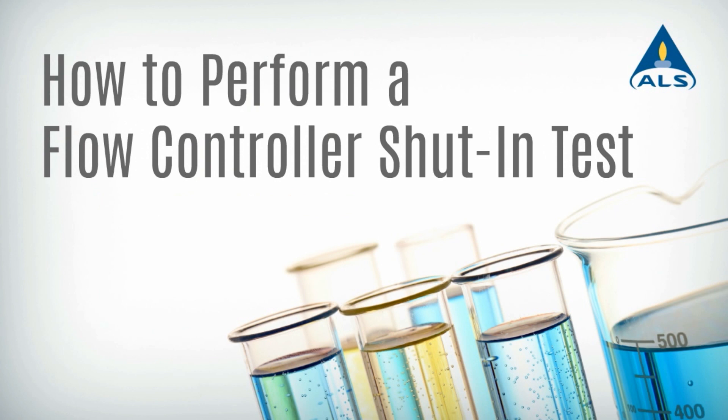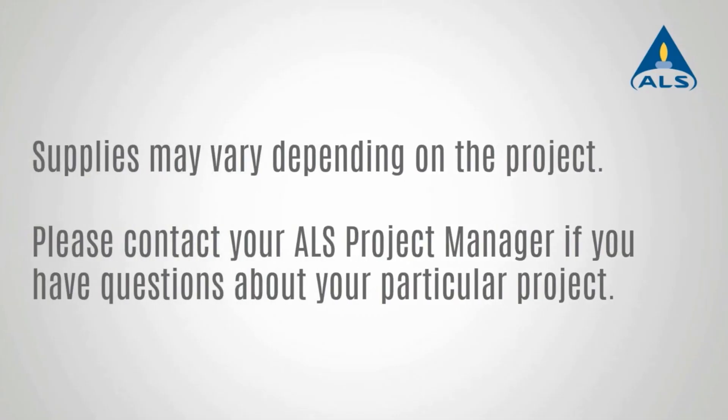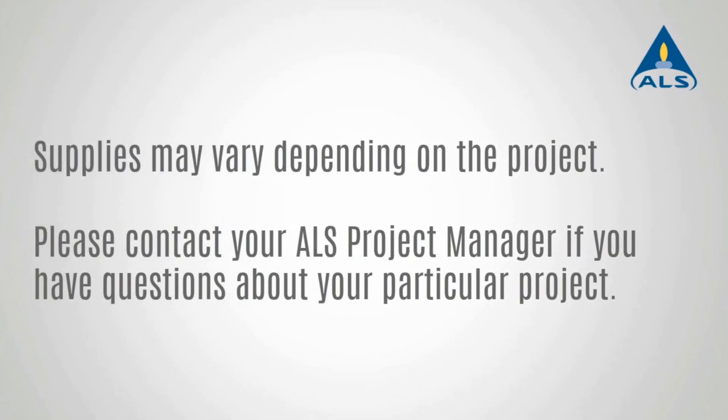Performing a shut-in test can ensure your canister and flow controller are leak-tight prior to sample collection. Use this short video as a guide to help you assemble and properly conduct a shut-in test. If you are not using a flow controller to sample, it is not necessary to conduct a shut-in test.